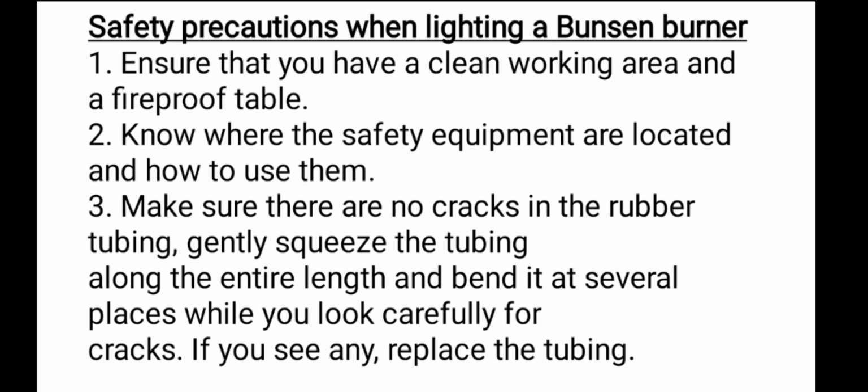The second is know where the safety equipment is located and how to use it. Otherwise, in case of any fire that hurts, you will not be safe.